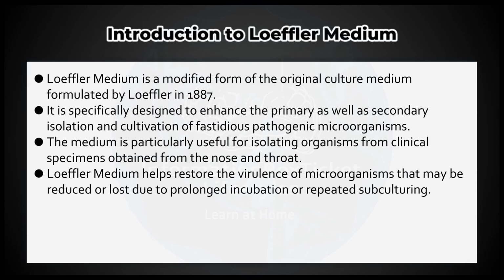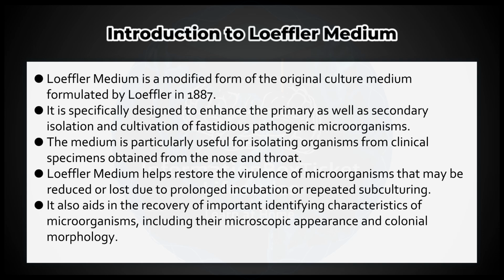Loeffler Medium helps restore the virulence of microorganisms that may be reduced or lost due to prolonged incubation or repeated subculturing. It also aids in the recovery of important identifying characteristics of microorganisms, including their microscopic appearance and colonial morphology.